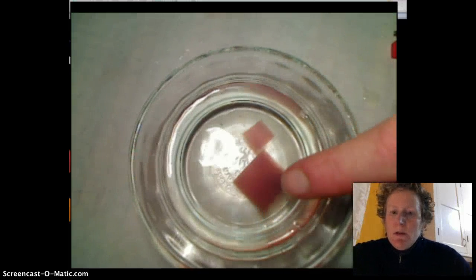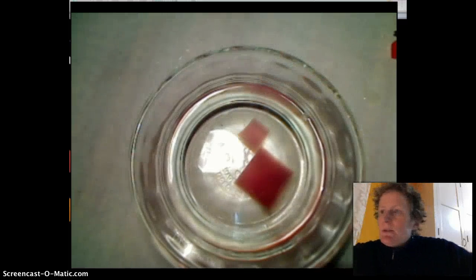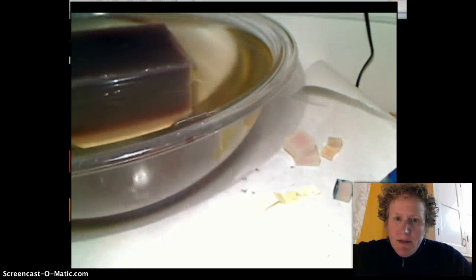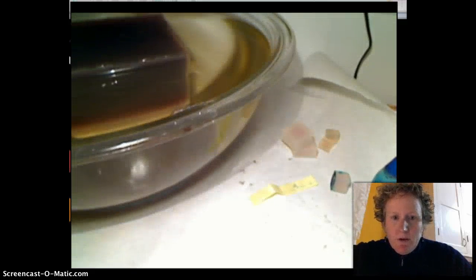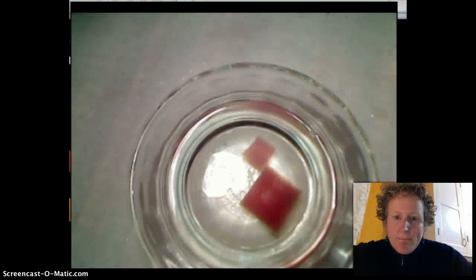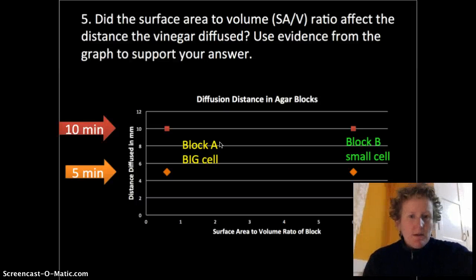I'll toss a couple of fresh cubes in there and we'll let it go for 10 minutes. There's a 2 centimeter cube on each side, there's a 1 centimeter cube on each side, and we've got our big monster 10 by 10 centimeter cube sitting in vinegar waiting for 5 minutes to go by. You can use the evidence from this graph that I made from an experiment I did earlier to support your answer for number 5.